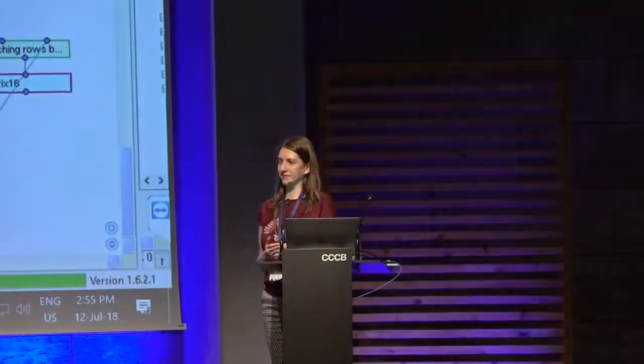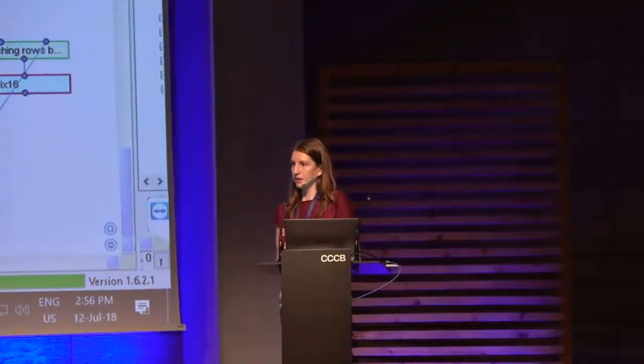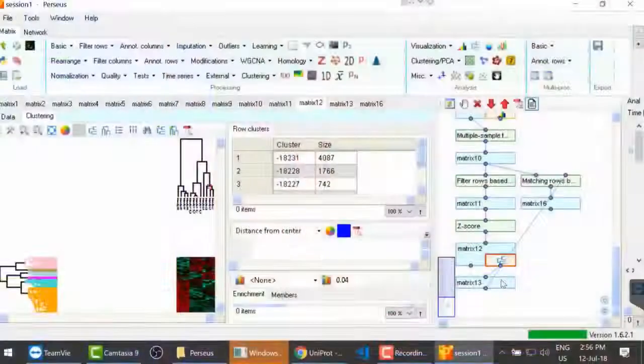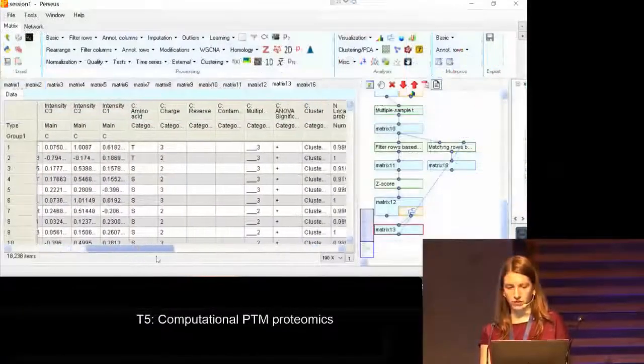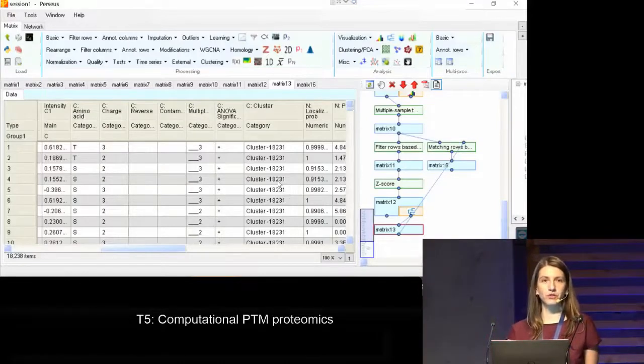Okay, I missed the point where I transfer the clusters into the matrix. Do you know what I mean? Where you export the clusters or where you match the two? Exactly. When I have now the clusters, but in the heat map. Okay, you have exported them, so you have a matrix in which you have the column cluster. Yeah, but I missed the point how to export them. How to match the 2 tables, you mean? No. Okay, I have it now, yeah. Okay, great. More questions at this stage?